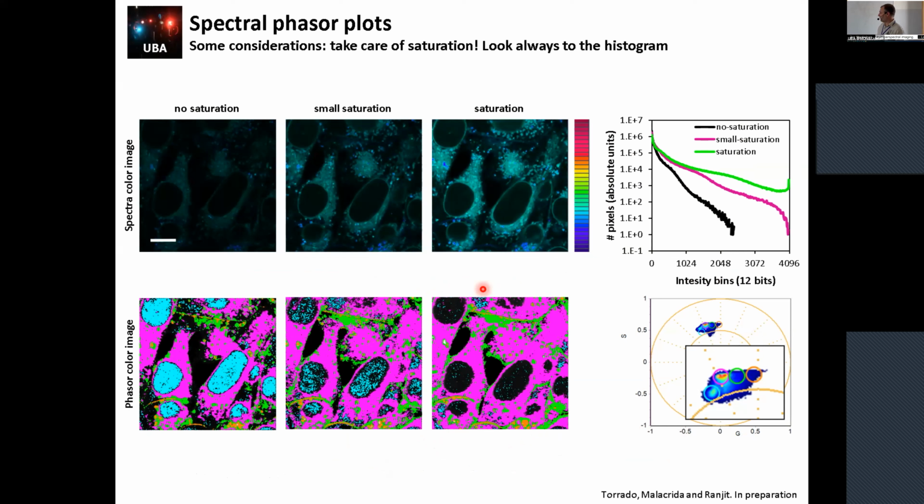And here I just did an acquisition in order to show that you can do the transformation, of course, and I put a cursor here in order to see how the coloring in the image changed. This is not saturated, and as soon as I begin to saturate, you see that the pixels move from where they were before in the image, and then you start to highlight different regions. So saturation is an important issue for hyperspectral images.